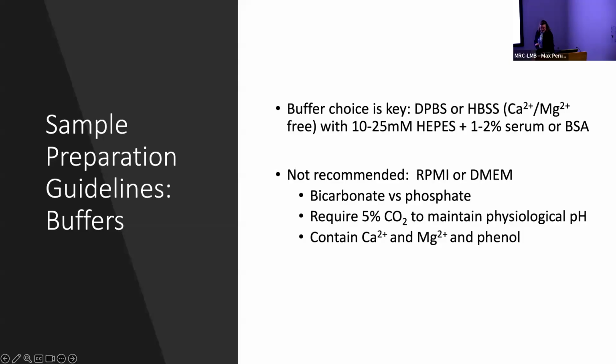The other thing you want to think about is also adding 1 millimolar EDTA in addition to the HEPES, sometimes 1 to 2 millimolar max for very sticky cells that are adherent, for example, so that it makes sure they stay in a nice single cell suspension for interrogation.